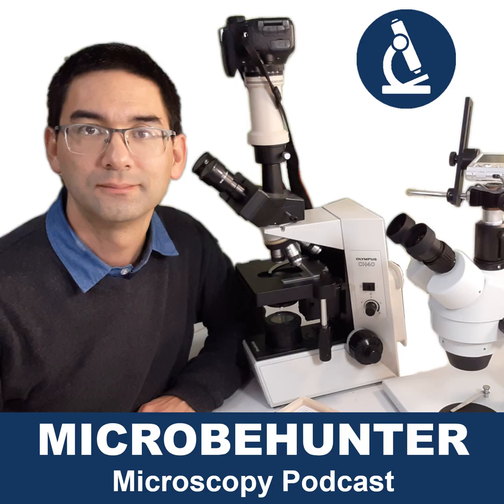If you can afford it, buy whatever your wallet allows, because it will then be for hobby reasons and for amateur reasons. If I had the choice between DIC and phase contrast, I would definitely go for DIC.